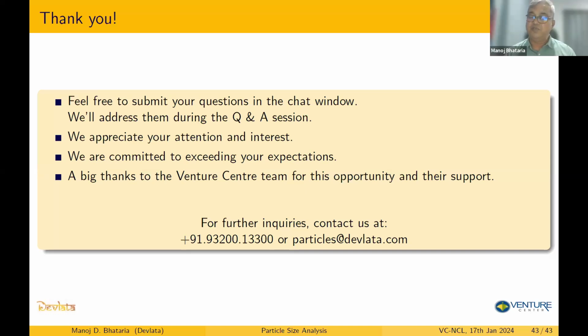So what happens is, let's say you have a 100 nanometer particle and a 200 nanometer particle, in the same number. The 200 nanometer particle is going to scatter something like 64 times more light than the 100 nanometer particle, because scattering goes as the particle diameter raised to the power 6. So then it becomes a problem.